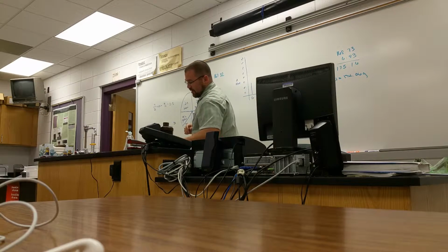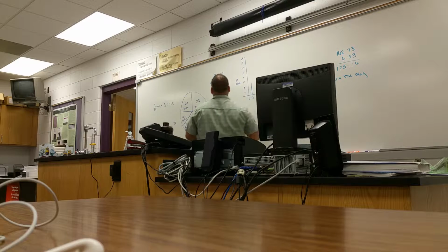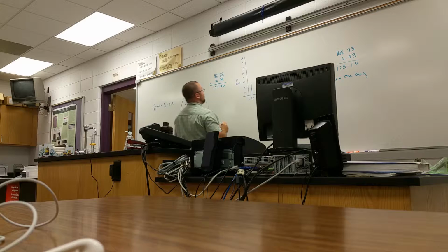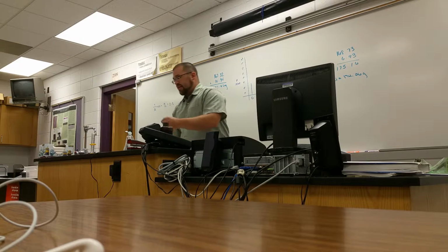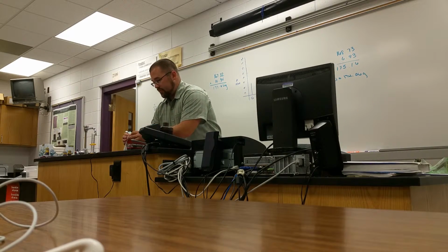And what this is, is 10.34 grams. So when we put all of this together, our overall mass should be 177.66 grams. So let's see if even after the reaction, that's what we still have. It should be close. We'll see how it works out.